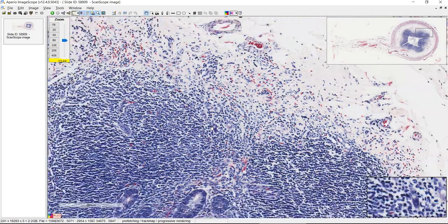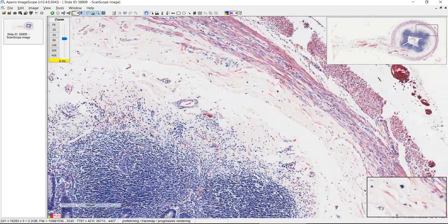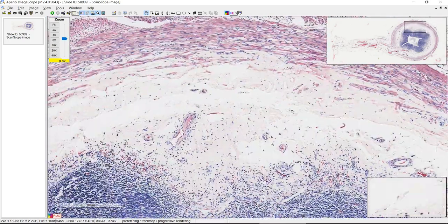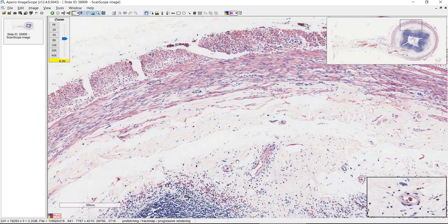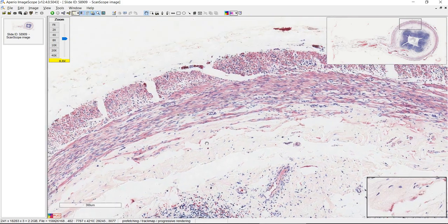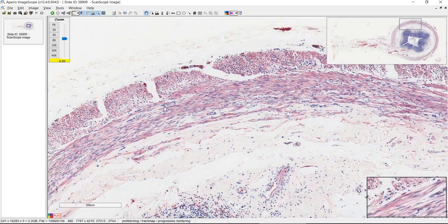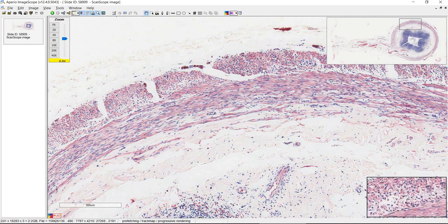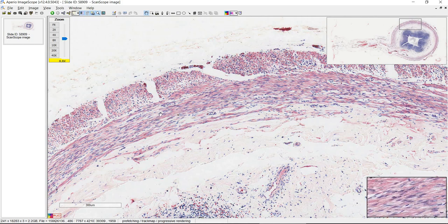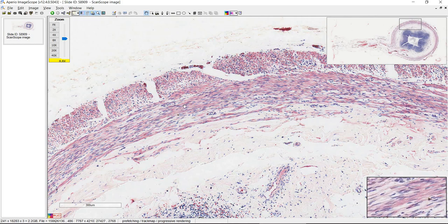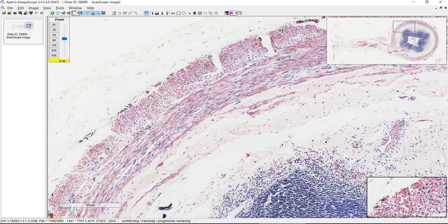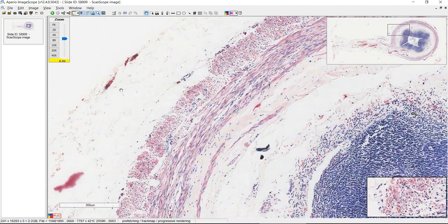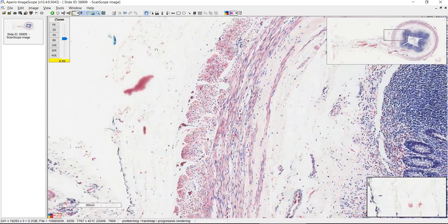Other than that, the submucosa out here is mostly collagen and some blood vessels. You have your two layers of muscle in the muscularis externa — the inner circular and the outer longitudinal. And we have the serosa on the outside.